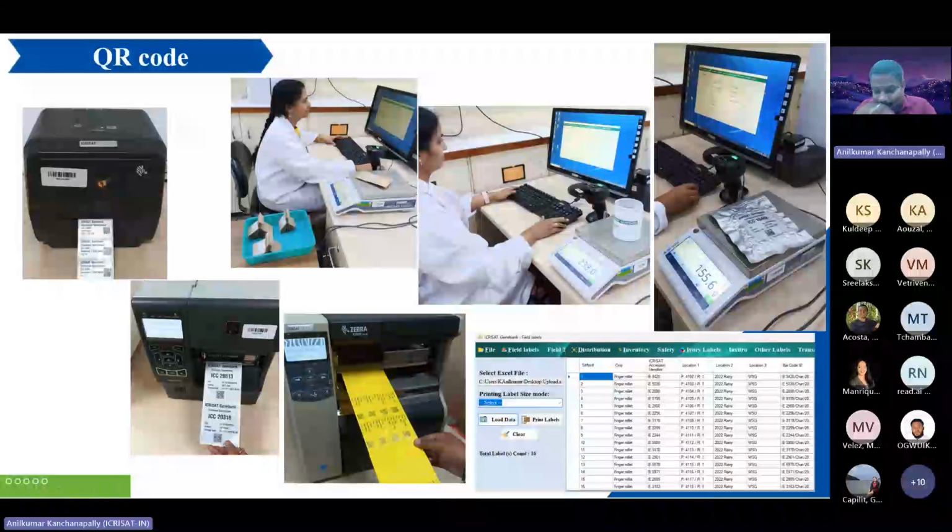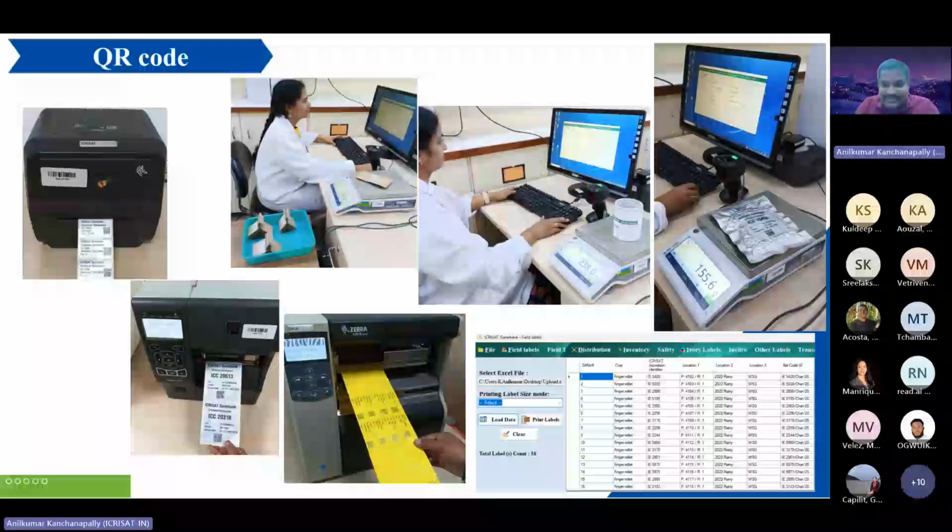Means after regeneration, we have to transfer. After regeneration, the seed lab team will transfer the germplasm into bottles. The IT team will inventory the newly transferred accession through the barcode QR code system. So you see here, 238 gram, we are increasing the weight in the database.